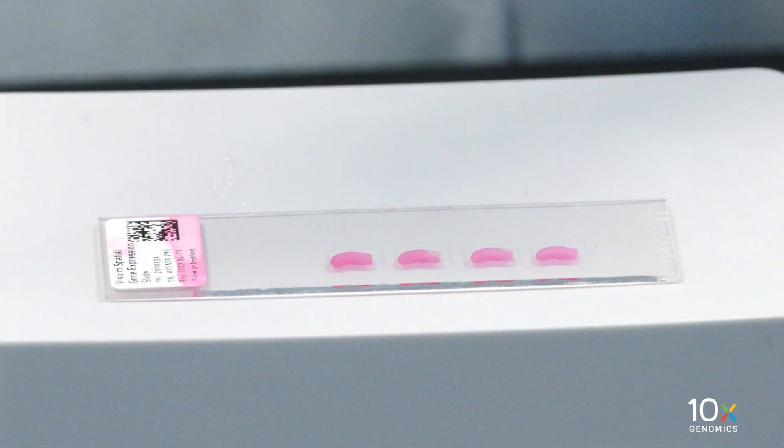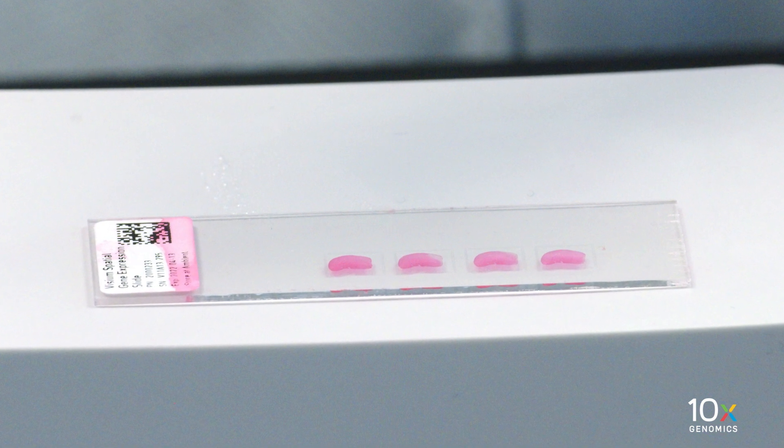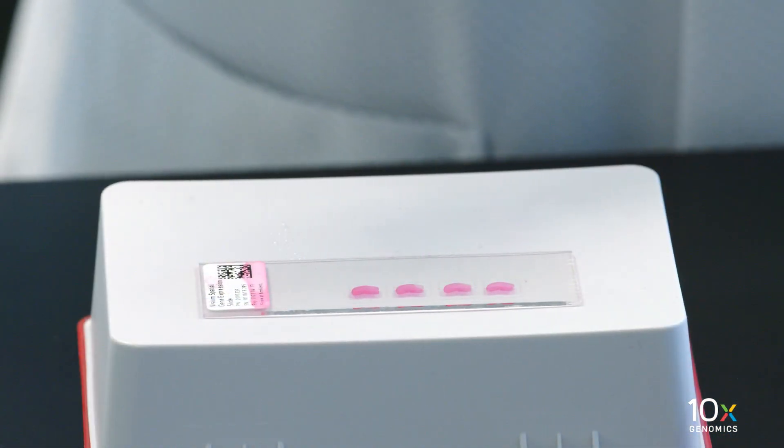We have completed tissue staining. Now we will place a cover slip on the slide. We have the deparaffinized H&E stained Visium Gene Expression slide. Place the slide on a flat, clean, non-absorbent work surface.